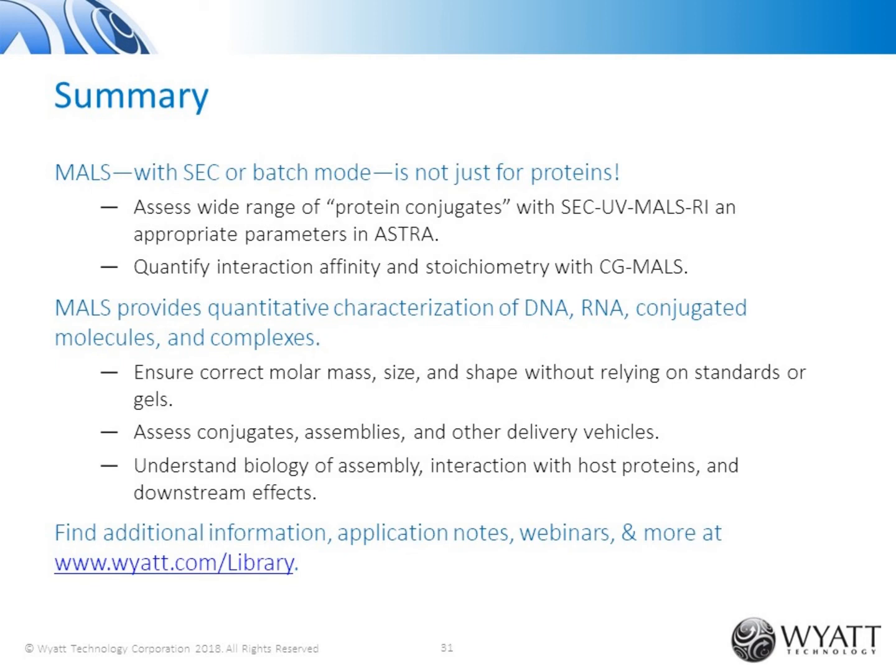So watching it longer wouldn't cause more of those species to appear. What would cause more of those species to appear would be to maybe change the concentration of either the CRE or the LOXP and have more material available for binding, and then we might see more of that 4:2 stoichiometry present.